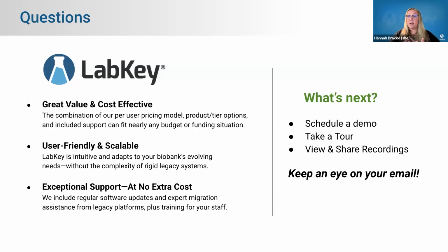And so again, one of the things that LabKey wants to do is empower you as a biobank to make these changes on your own without having to rely on an IT group or a third-party group. We allow you to do that, and that is one of the things that our training and support is really focused on as well, making sure that you can make those adjustments because science isn't stagnant, it changes all the time. And so we want you to be able to do that as well.